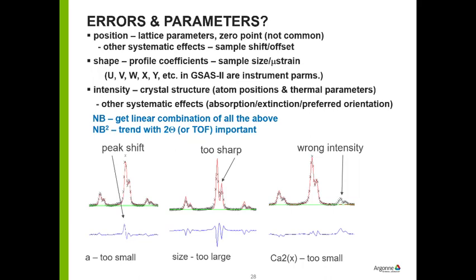On the other hand, over here, if the intensity is incorrect, that means that the calculated peak and the observed peak will have the same shape, but different magnitudes. And so the resulting peak will look like a peak, a 0 derivative, okay? If the calculated peaks are too sharp relative to the observed pattern, then what you see is a curve that goes up, down, back to 0.